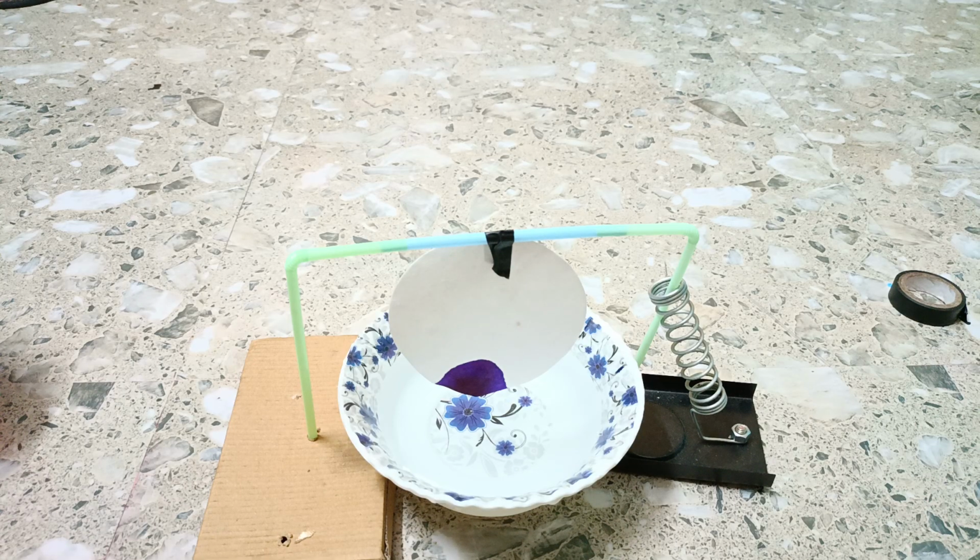Hello friends, today we are going to make an experiment of what we call paper chromatography. Here you can see we have made a setup for the experiment of chromatography.